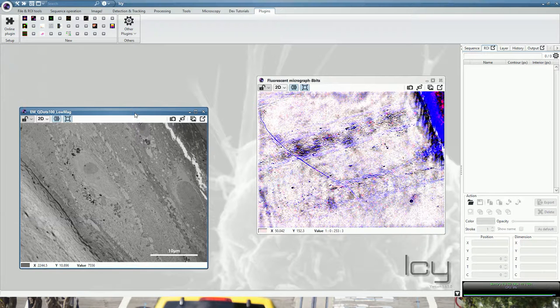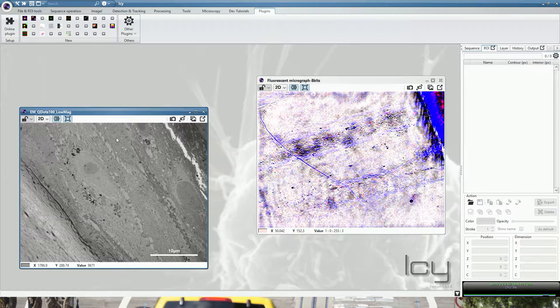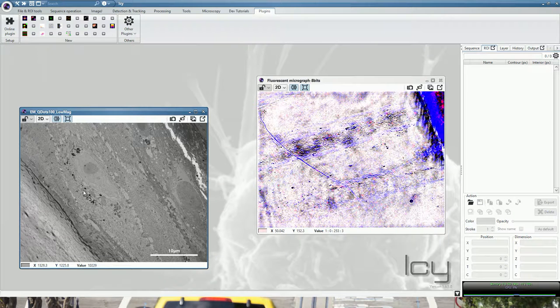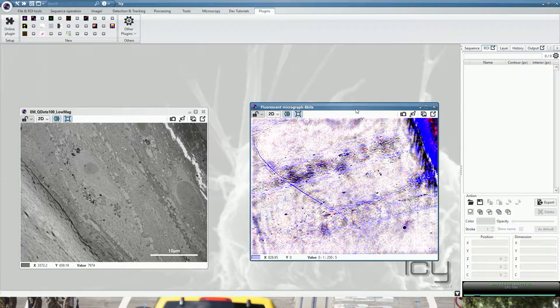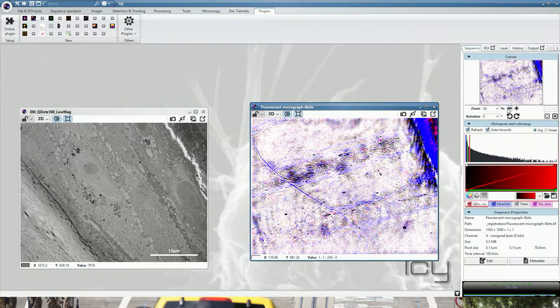Here on the left hand you have the electron micrograph of a synthetic reconstituted epidermis. Here on the right side you have the equivalent fluorescence micrograph containing several channels.